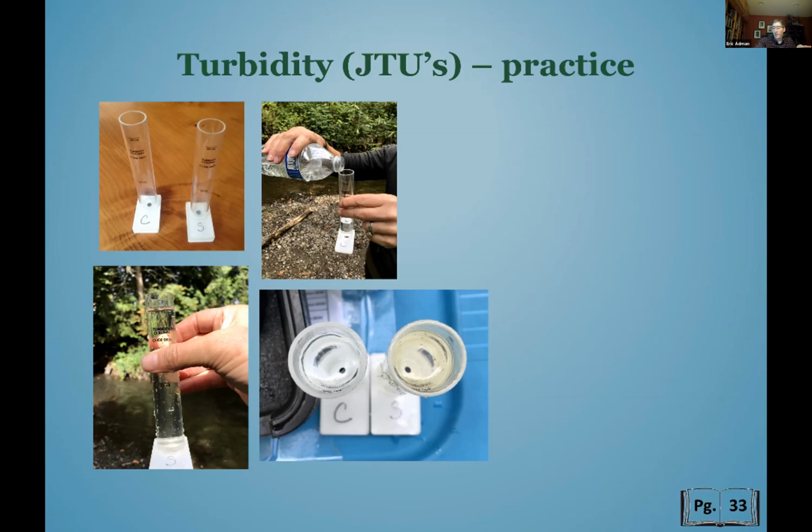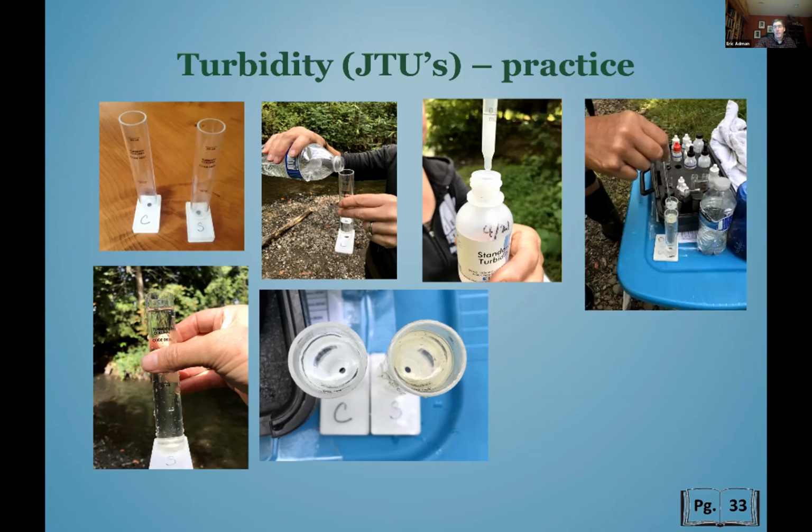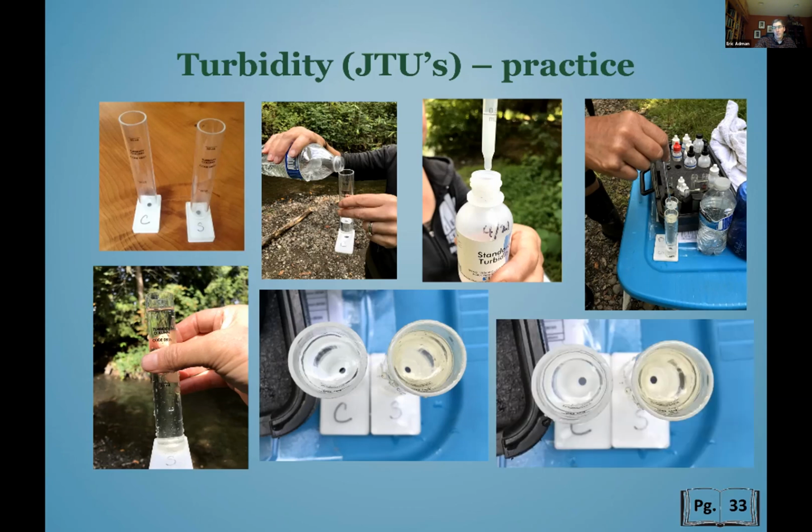And if they both look the same, then you know that you have relatively little turbidity, but you'll still add some of this turbidity reagent to the control, and you're essentially going to keep adding it until it becomes more cloudy than the sample, and you won't count that last addition when you record your additions. So that's an example of the turbidity reagent being drawn up and added to the control water, and then looking down, you can see that now it's more opaque or fuzzy.